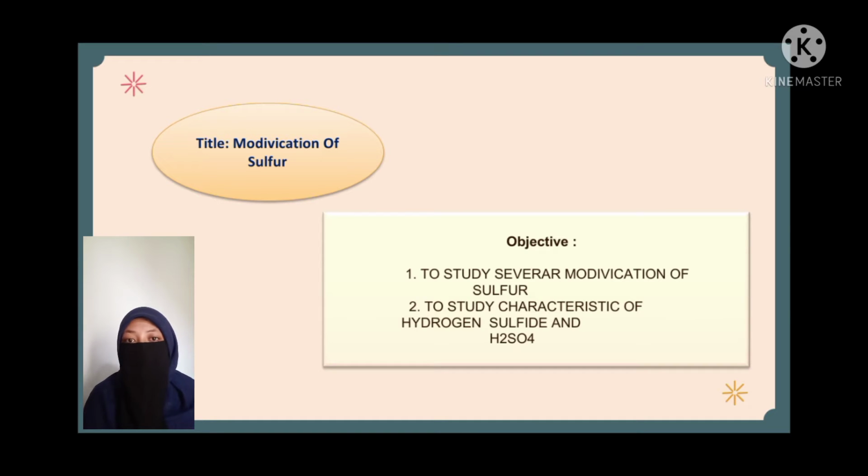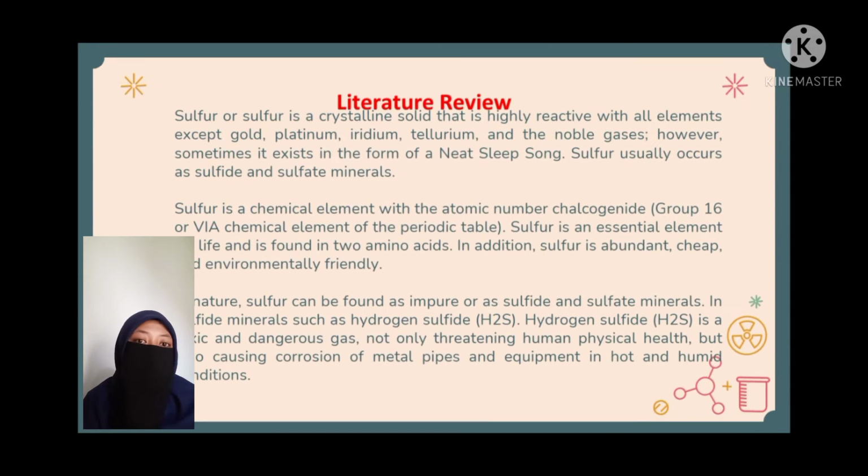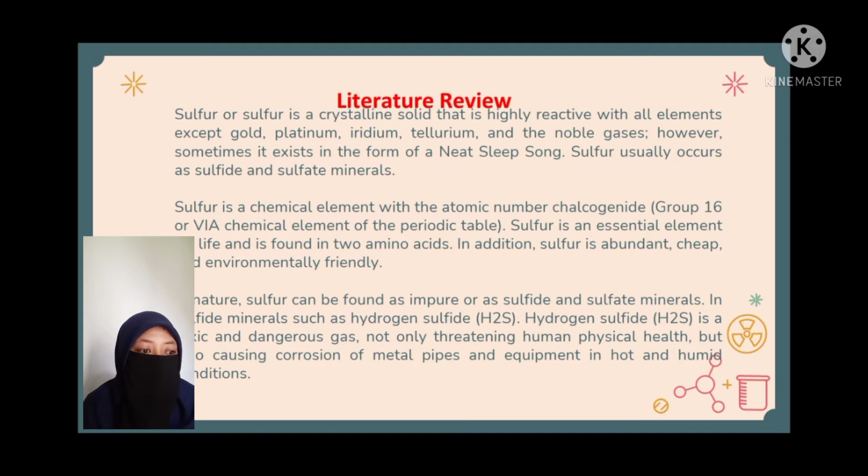Title: Modification of sulfur. The objectives are: Number 1, to study several modifications of sulfur. Number 2, to study the characteristics of hydrogen sulfide and H2SO4. Next, the literature review.